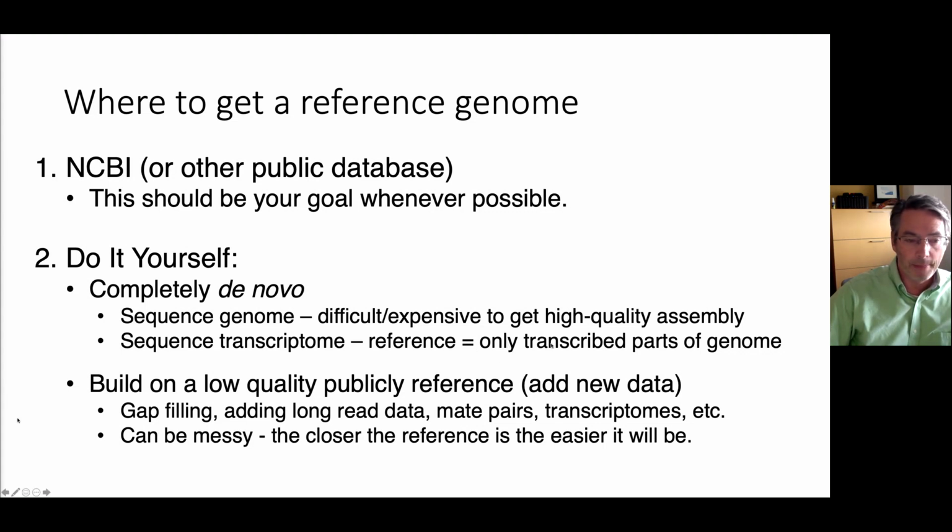The other thing that you might be doing, if you're just interested in transcriptomes, is an RNA-seq project and then de novo assembly of those transcriptomes, and that transcriptome becomes your reference. So you don't have the whole genome, you just have the expressed genes, but then you can go back and align reads to that. And in an RNA-seq experiment, how many reads align gives you some indicator of how much that gene was being expressed.